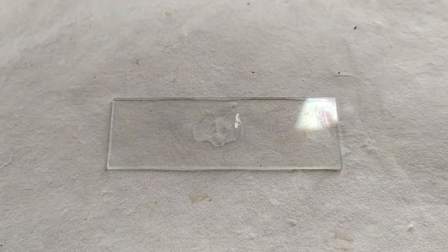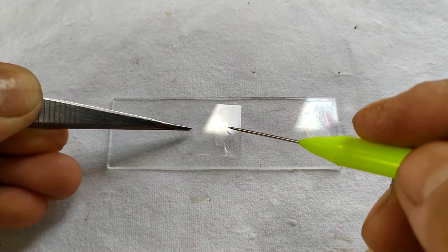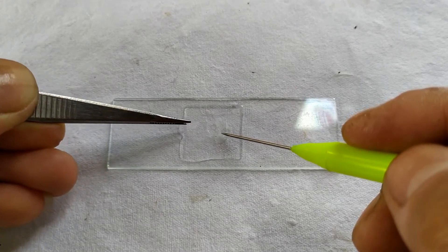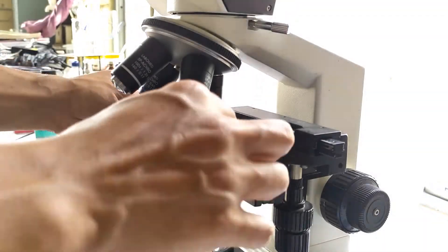Place the peel on the slide in a drop of water and cover it with a cover slip, making sure to avoid any air bubbles. Observe the slide under the microscope.